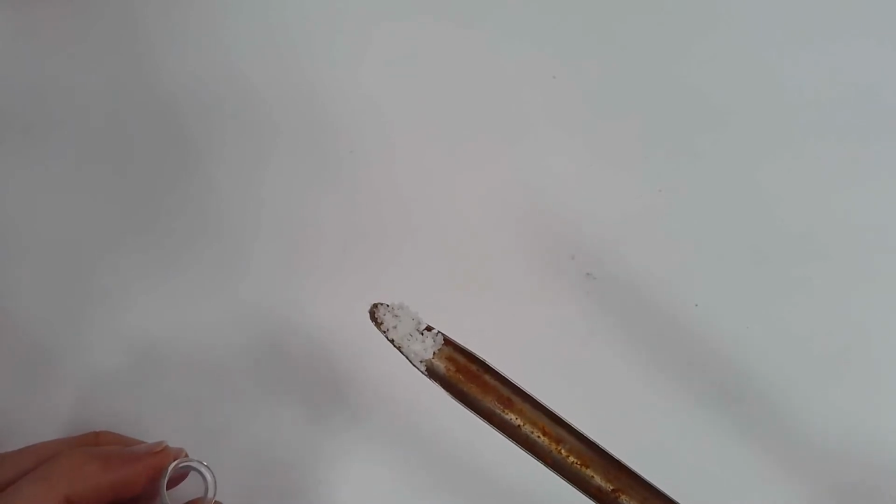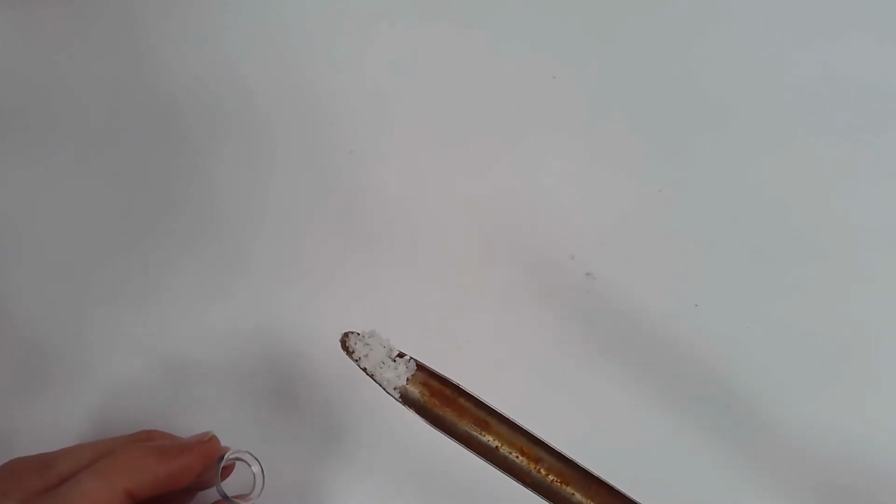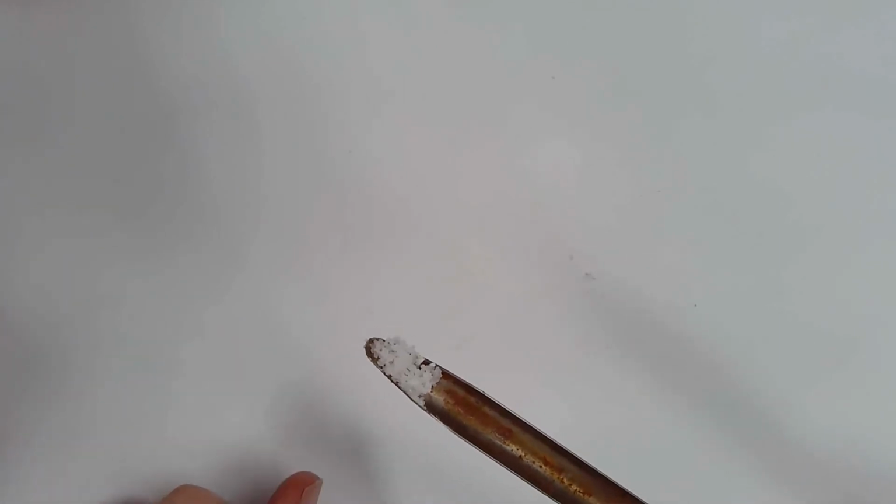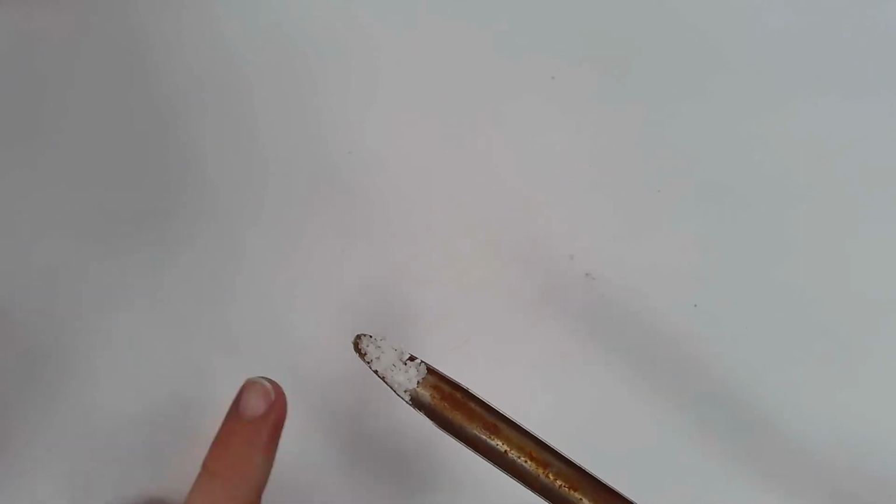You can see it's just a white crystal powder. Relatively dangerous, this stuff. If you get it on your skin, it will turn it to soap. Now, this isn't an acid. It's the opposite of an acid. And I know we haven't actually covered that just yet, but still I want to ask the question here. What's the opposite of an acid called?